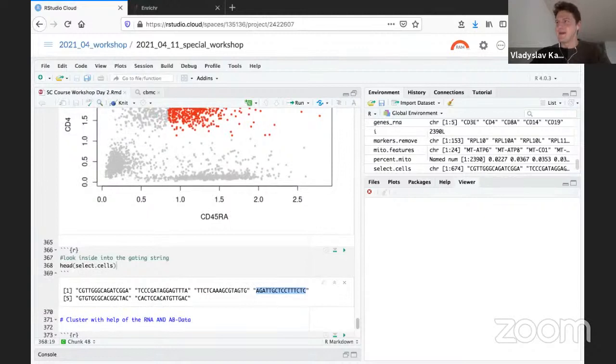Regarding the question about myeloid and T doublets: did you mention that they can be phagocytized by other immune cells? For example, they seem to have a lot of Cd4, Cd8. Have they engulfed some of these T cells? Yeah, that might be the case, especially if we are working with tissues like spleen, where you have a lot of phagocytes that can eat the T cells. Or in this case, you have cord blood mononuclear cells, so it can happen that a myeloid cell just eats, phagocytoses, the other T cells.